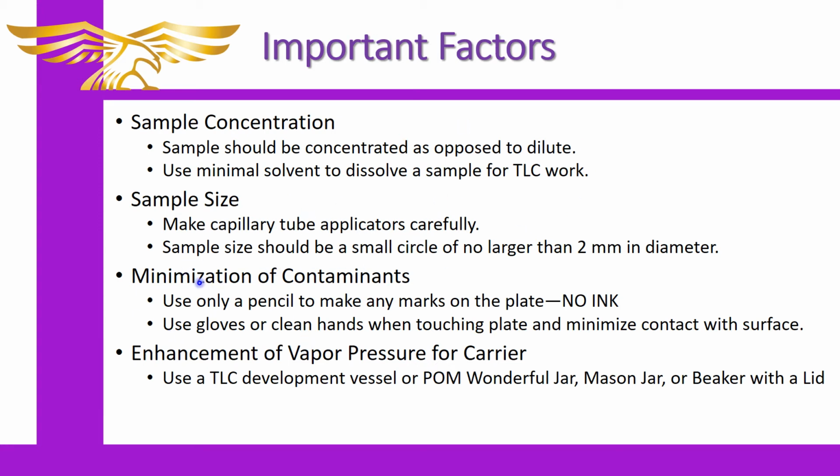Okay. We will discuss a method you can use to kind of help you meet that size when we talk about how to make your capillary tubes for spotting.